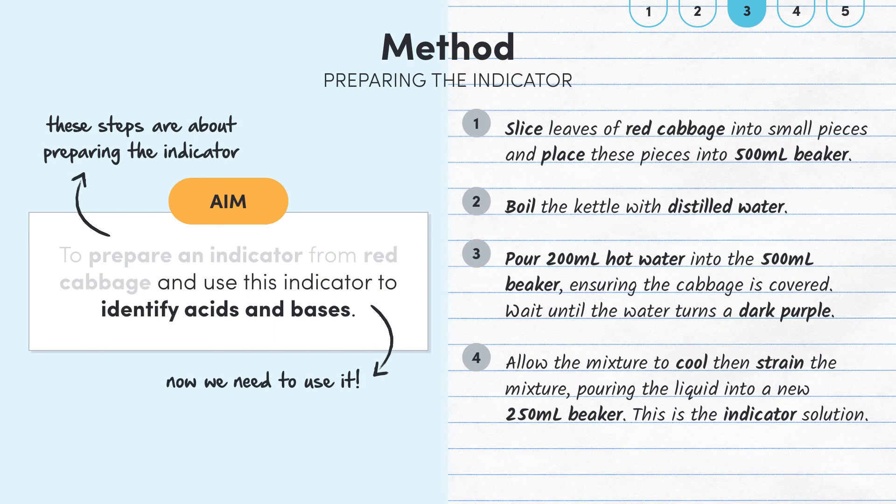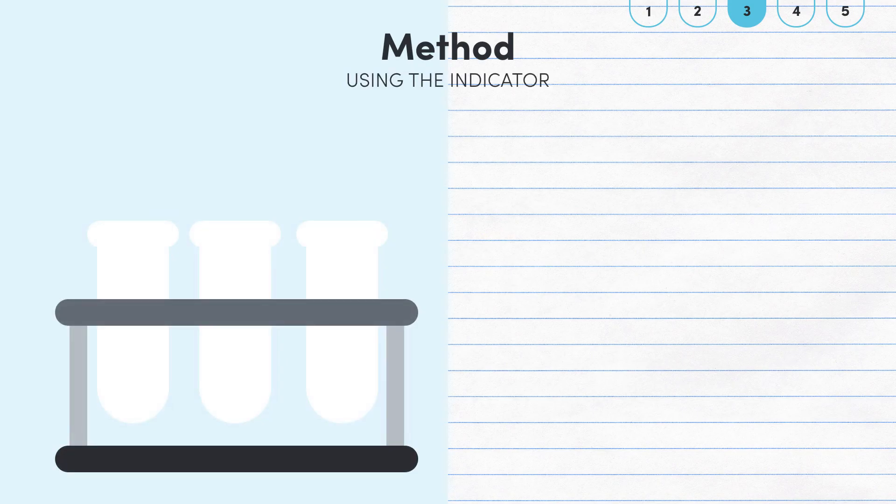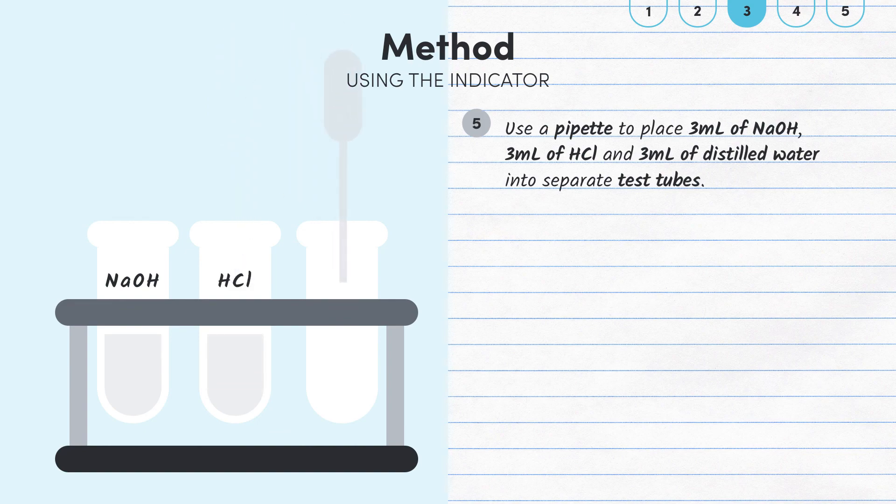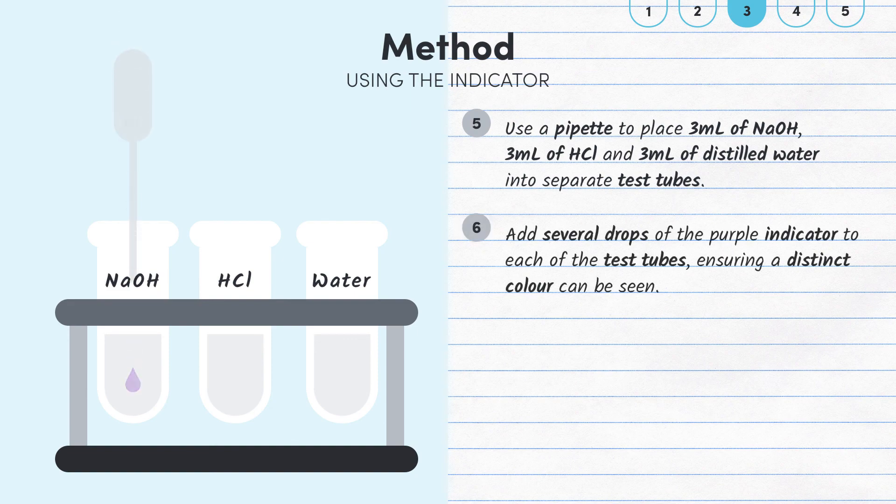But we still need to actually use the indicator to test the properties of acids and bases. So, continuing with our method. Use a pipette to place 3ml of sodium hydroxide, 3ml of hydrochloric acid and 3ml of distilled water into separate test tubes. Add several drops of the purple indicator into each of the test tubes, ensuring that a distinct colour can be seen.